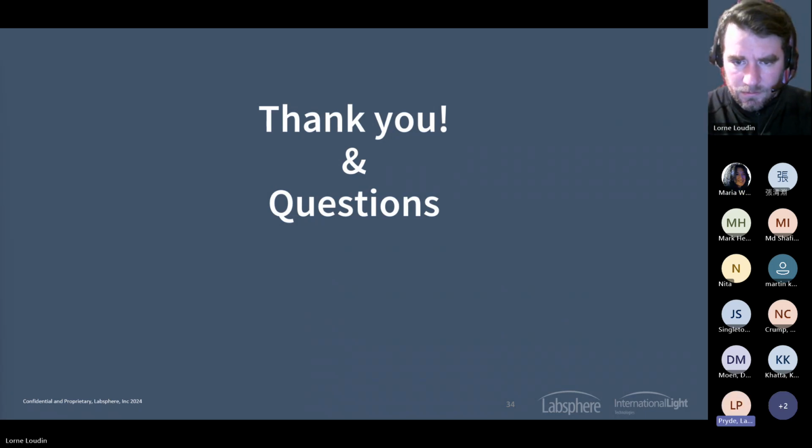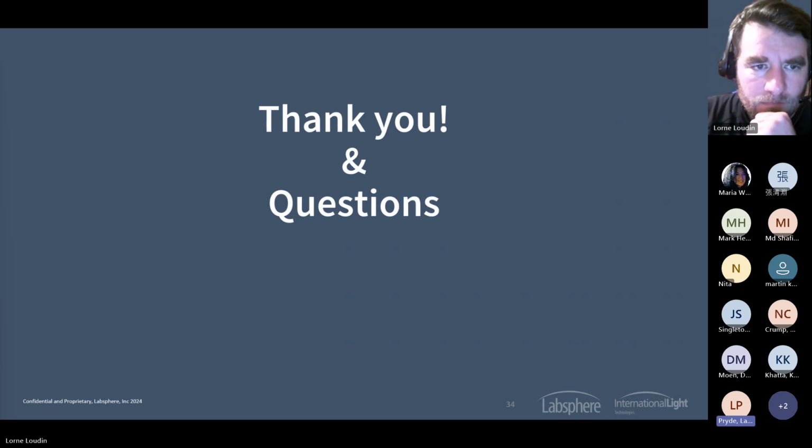Thank you for the excellent seminar. I have one question. As you know, I've worked for Oriel for 26 years, so I've seen it all with all these sources. There is a certain dichotomy between if I'm building an instrument and I want everything in one box, I'm obviously going to go with a little deuterium lamp and a little quartz tungsten halogen lamp. We tend to do more of the linear spectroscopy system, so we're not limited necessarily by space. Personally, I feel that nothing beats a straight up xenon arc lamp, and the QTH lamp is a little more stable, and those are basically the two sources that we typically deal with, unless we're going out into the far IR.